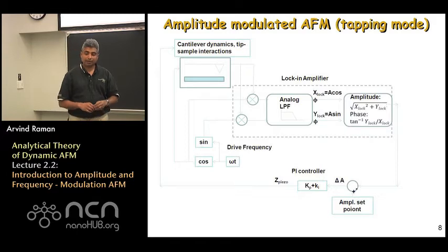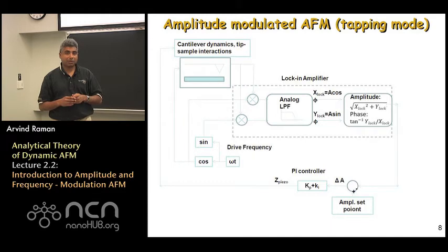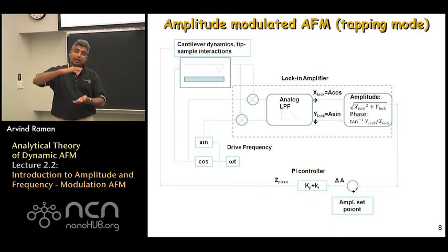And so here I show an overall flowchart for tapping mode atomic force microscopy. Based on what we have discussed, we have an AFM cantilever, and we drive it with excitation frequency omega, preferably close to the resonance frequency omega naught, and we move the Z piezo, or the sample position, up and down in order to keep amplitude constant, and all the time we allow the phase, which is the output of the lock-in amplifier, to change from point to point on the sample.